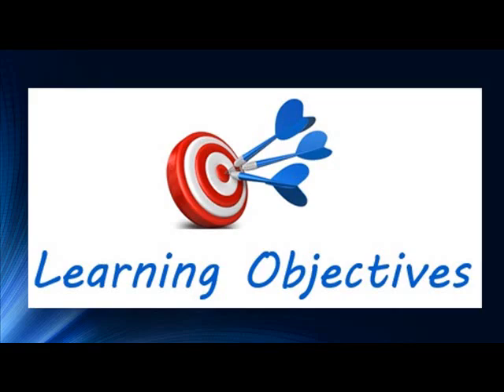After completing this lab, you should be able to observe the physical properties of 4 different chemicals: water, isopropyl alcohol, glycerin, and liquid detergent. You will compare your observations and reach conclusions about each. You will also learn about solutions and how to prepare them based on volumes. You will gain an understanding of density.